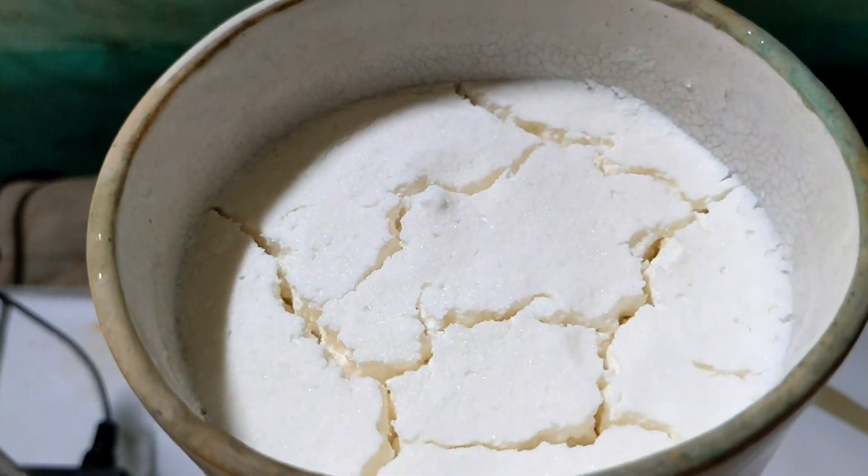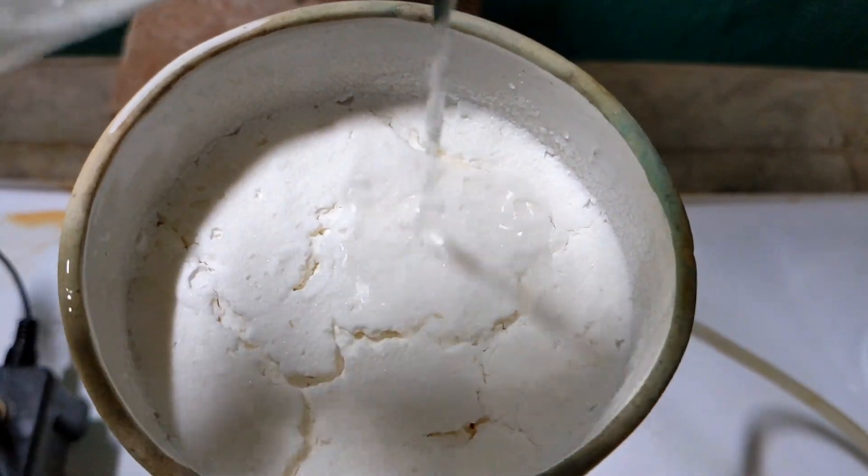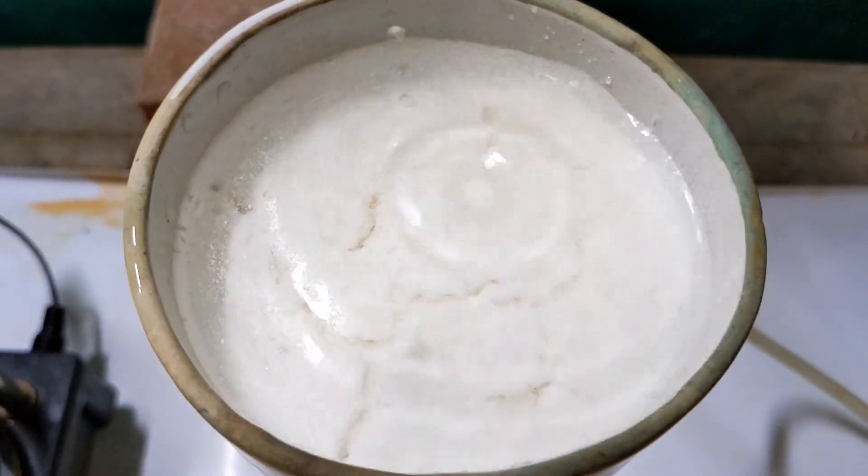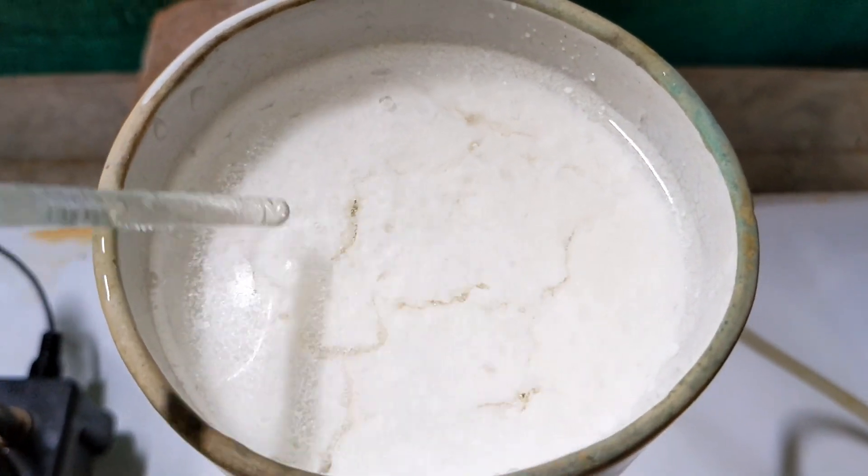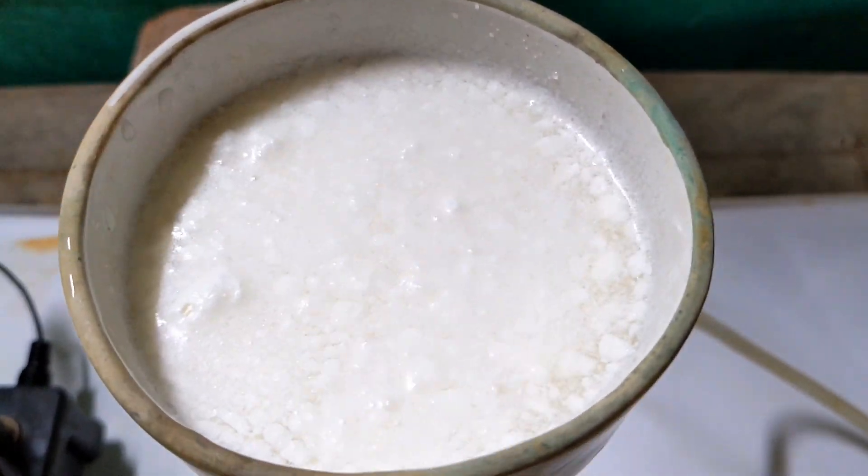Now we will be purifying the benzoic acid crude product by recrystallizing it from hot boiling water. Before going to the recrystallization part, I washed the crude benzoic acid a couple of times with distilled water to remove the excess acid present.